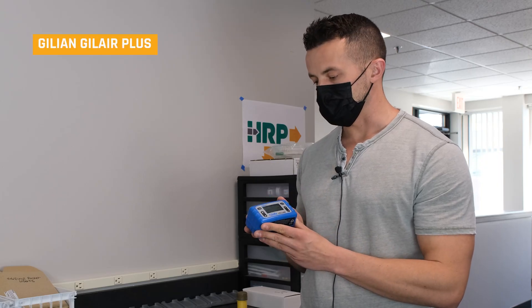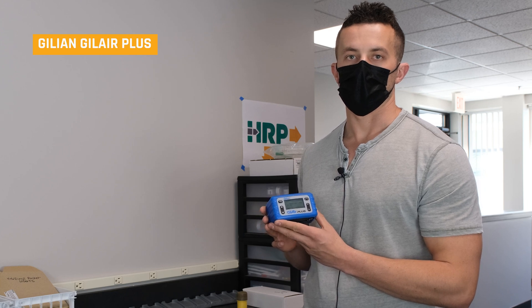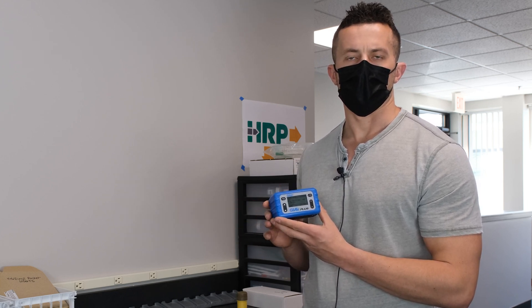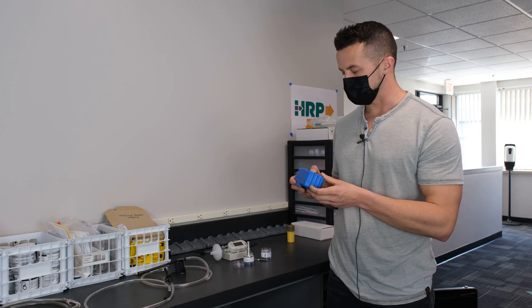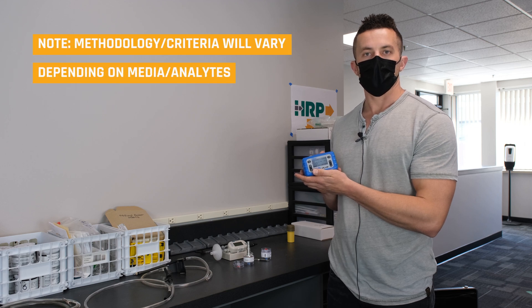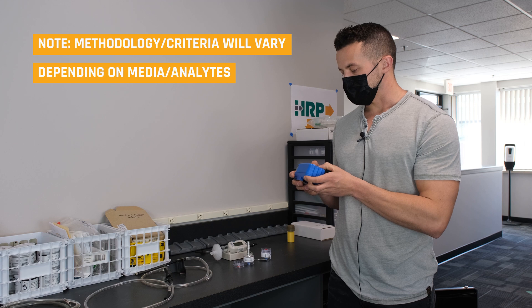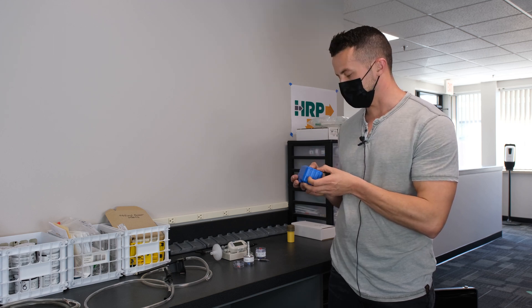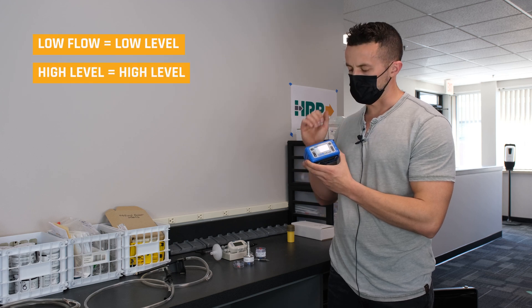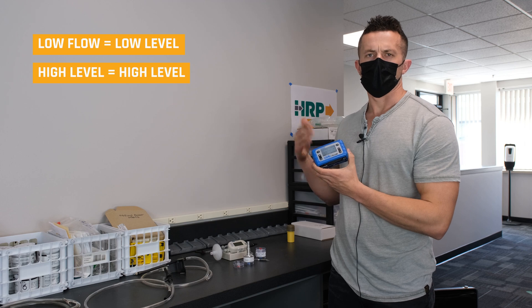Here we're going to be working with the Gillian GilAir Plus. Depending on the sampling pump you have, the calibration methodology could be a little different with how you adjust the pump. We're going to adjust the flow to what we think is necessary. It's going to give you a flow on the interface — never rely on that. We're just going to set it to what we think would be necessary for the sampling, with a lower setting for lower flow and higher for more flow.